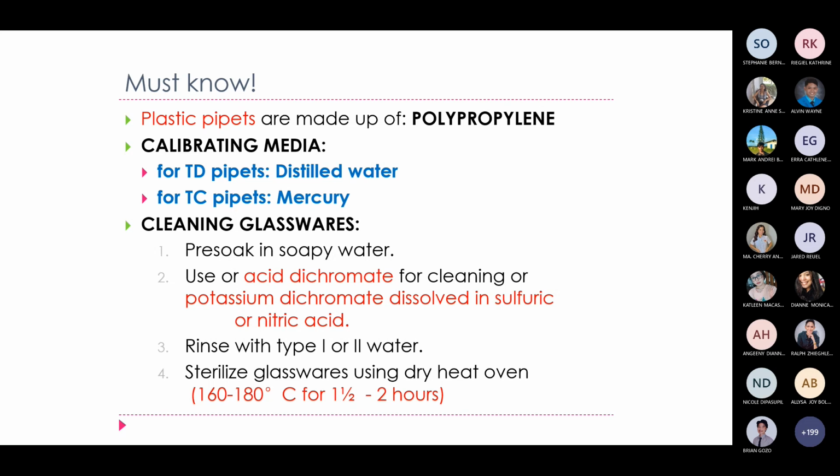Okay. And for sterilization naman, using the dry heat oven, okay, ilalagay mo siya sa dry heat oven with a temperature of 160 to 180 degrees Celsius for 1.5 hour to 2 hours. Ano to ha? Degrees Celsius.